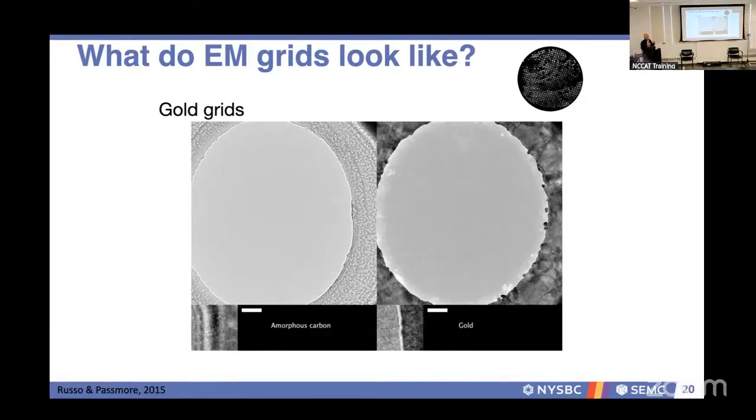And when the electron beam hits your grid, you can relieve some of that tension. So by having your foil and grid made out of the same material with the same thermal contraction, it's less likely for you to build up a lot of that force. I don't think anyone has really made use of that. There are mechanosensitive channels and targets. I don't think anyone has been able to appropriately use this particular byproduct in those studies.